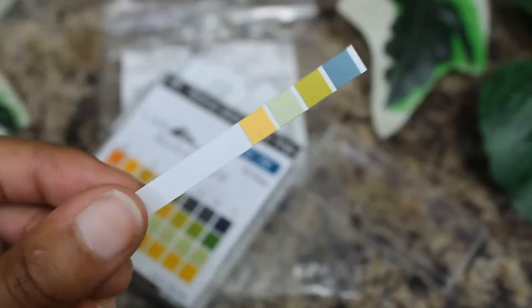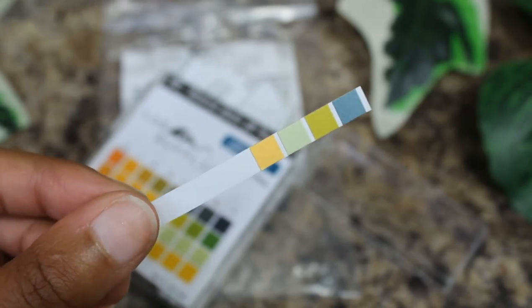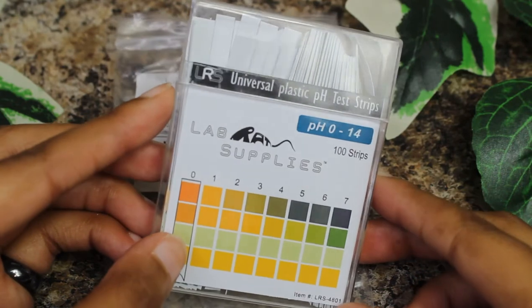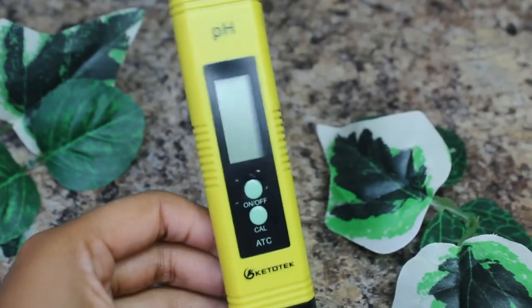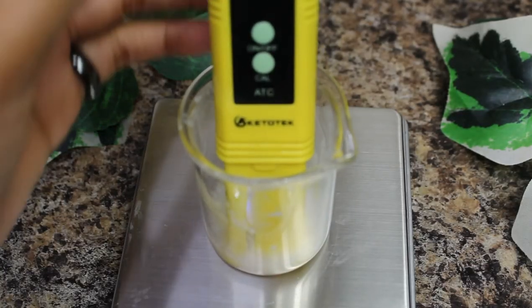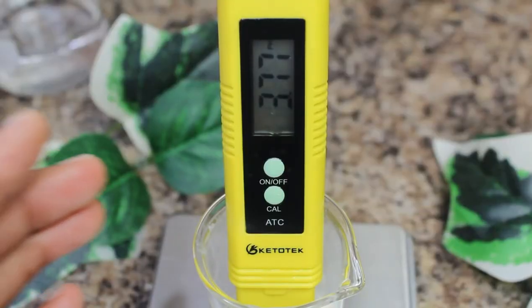Step three: check your product's pH. If you are using paper strips, dip it in the dilution and check the results using the chart your supplier provided. If using a pH meter, dip it into the solution and keep it there until the reading shows. Check your manufacturer's recommendations.